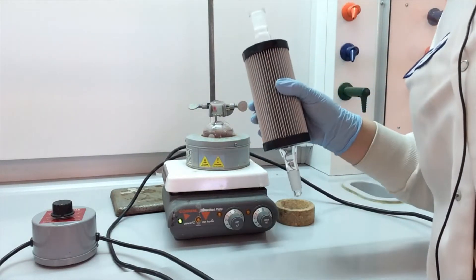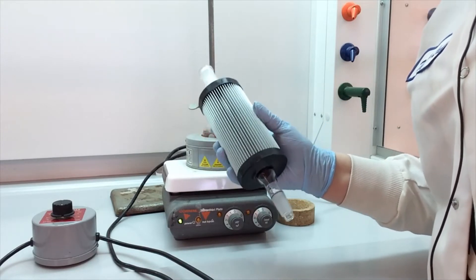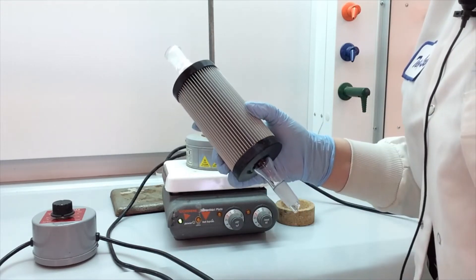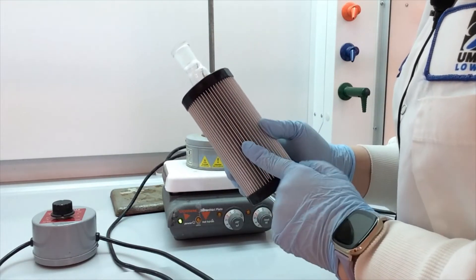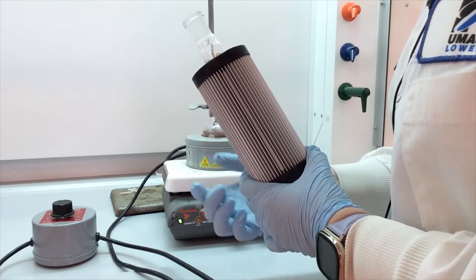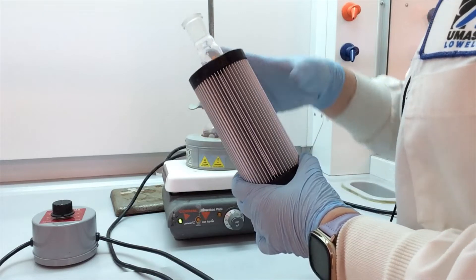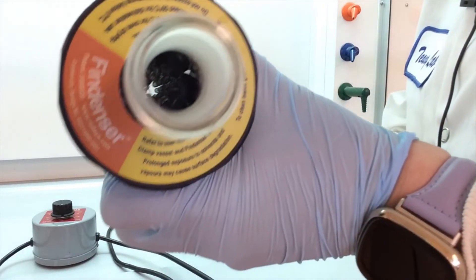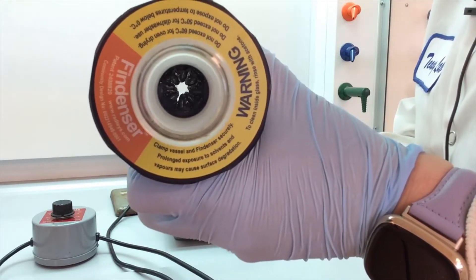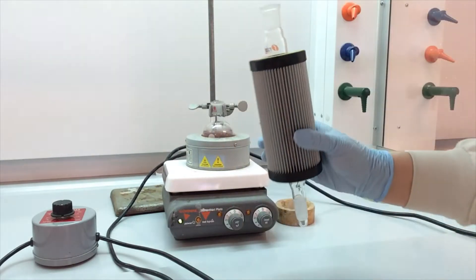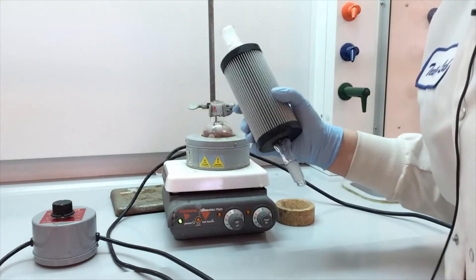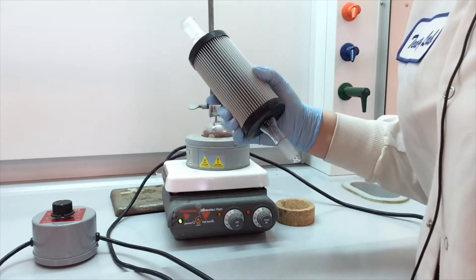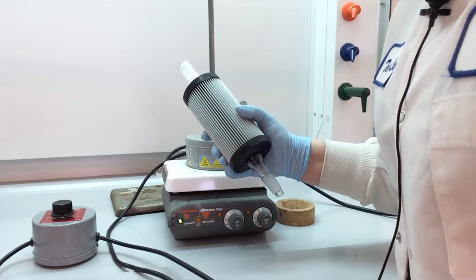So now we're going to use a waterless condenser, also known as a fin denser. We don't need to use running water to cool this down. We have these aluminum fins that help remove the heat from the center of the condenser out into the lab. Also, there is a high surface area on the inside that also helps recondense vapors without any cooling water. So this is a much more environmentally friendly way to run a reflux. We are not wasting water unnecessarily.